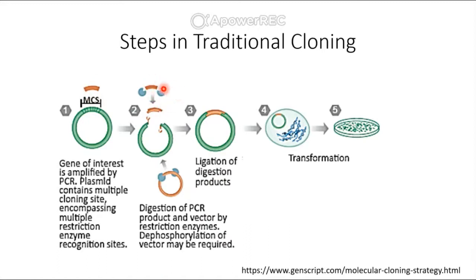Here, these little blue Pac-Man symbols represent the restriction enzymes. So our amplified and digested gene, we can then paste into the digested plasmid if we use the same enzymes on both the plasmid and the gene of interest. And then lastly, we'll have our transformation, which we haven't really talked about yet.